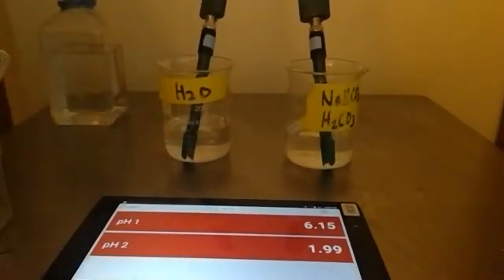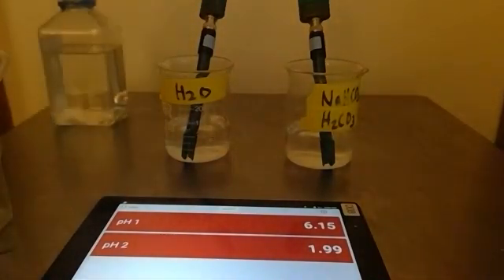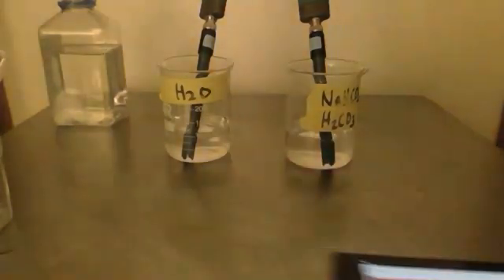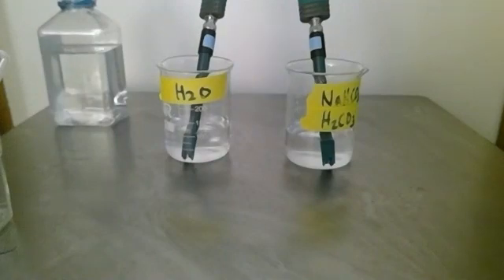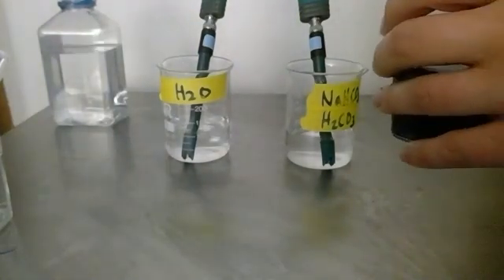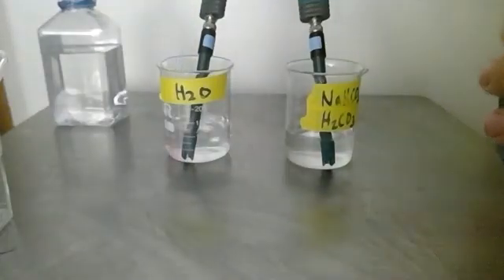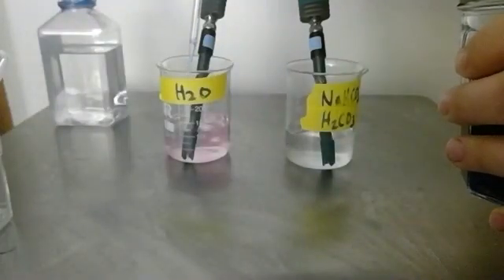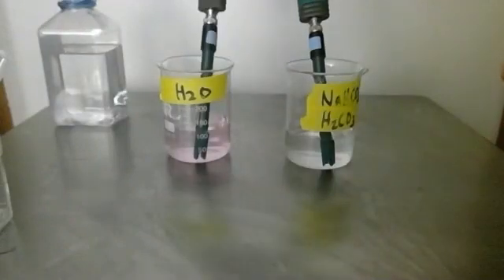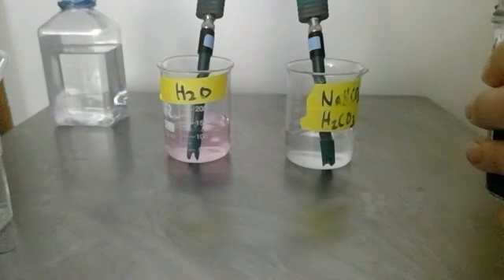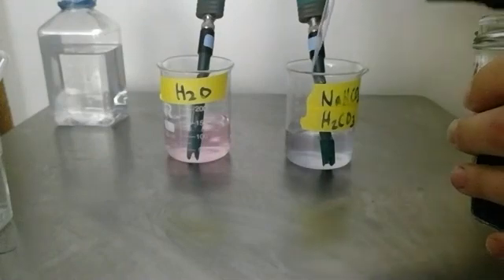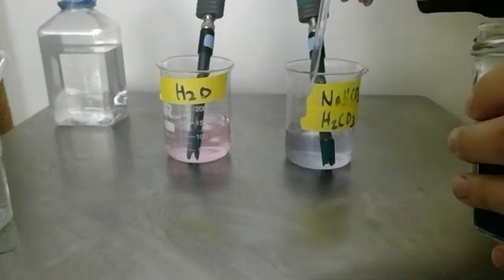I have a pH for my buffer solution of 6.13 and a pH for my water of 1.99. Now a pH of 2 is pretty light in color. At this point, rather than continuing to go drop wise, I would like to stop and compare really quickly their colors. I'm just going to add a little bit of this blue indicator. It's very pink for the water, whereas if I add it to my buffer solution, it's still looking very blue.